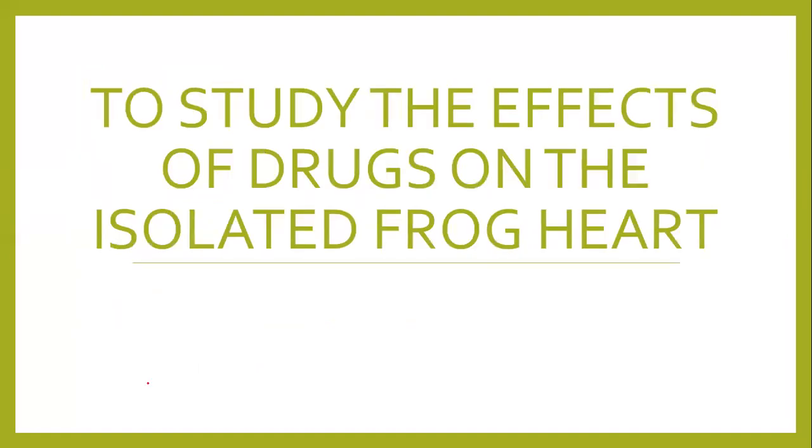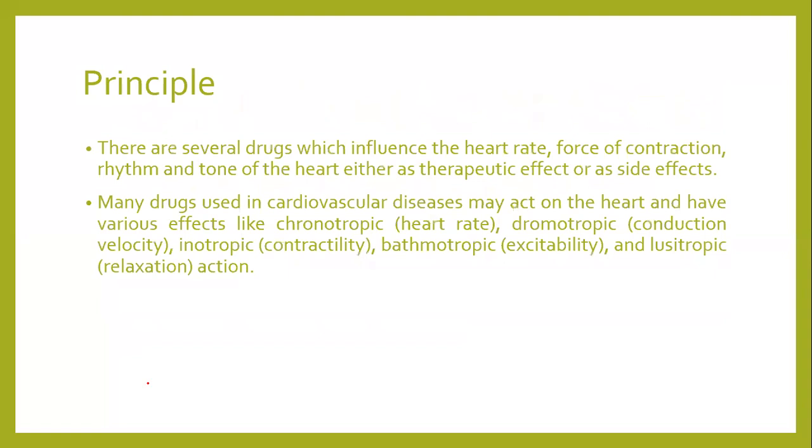Now we will actually start with the experiment, which is to study the effects of drugs on the isolated frog heart. Okay, so principle. There are several drugs which influence the heart rate, force of contraction, rhythm, and tone of heart, either as a therapeutic effect or as a side effect.